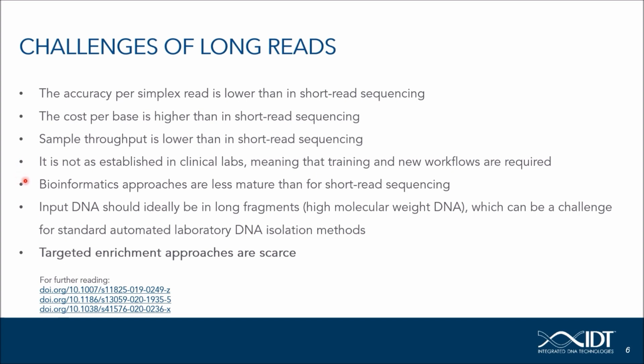Bioinformatic approaches are often less mature than for short read sequencing. And input DNA should ideally be in long fragments, so high molecular weight DNA, which can be a challenge for standard automated lab DNA isolation methods. So, targeted enrichment approaches are scarce. So new approaches for targeted enrichment, particularly for long-read sequencing, would be very useful.